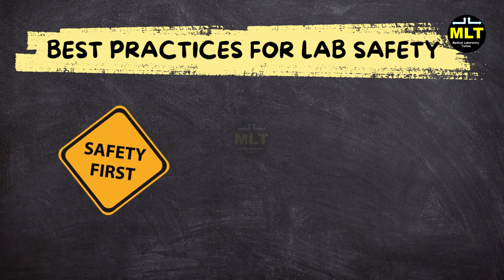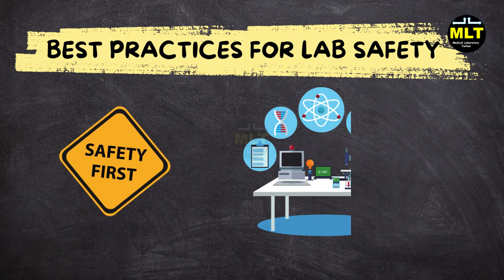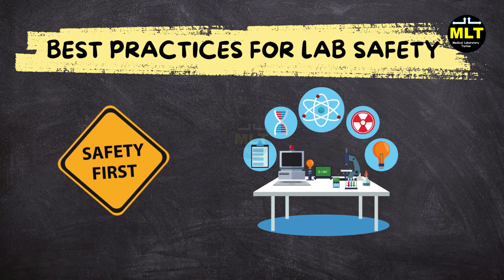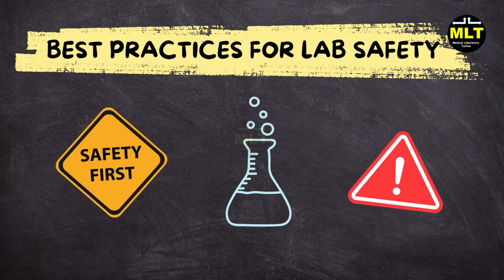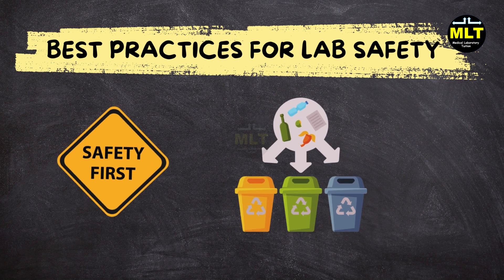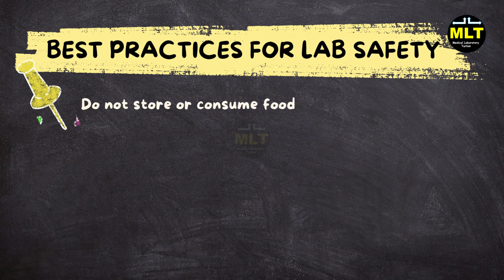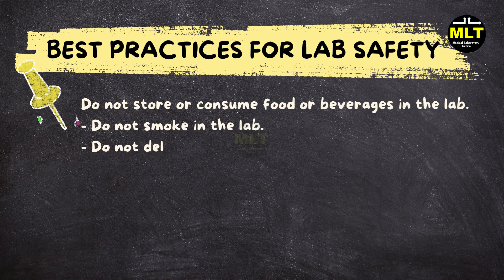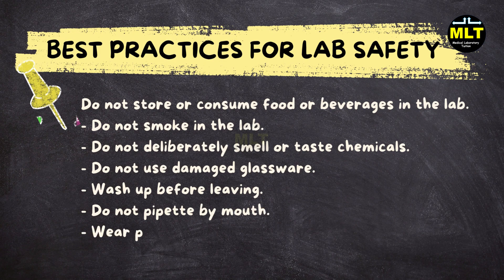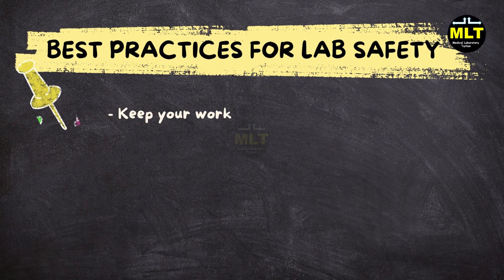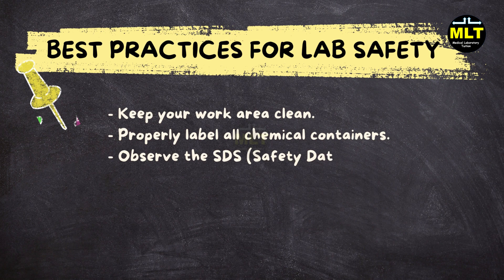Section 7: Best Practices for Lab Safety. Staying safe goes beyond just knowing what to do in an emergency — it's also about your daily activities in the lab. Regularly check equipment and ensure chemicals are labeled and stored properly. A clean workspace is key to avoiding accidents and contamination. For instance, if you leave chemicals uncapped, they could evaporate and create hazardous fumes. Properly dispose of chemical, biological, and sharp waste materials to maintain a safe environment. Important reminders: Do not store or consume food or beverages in the lab. Do not smoke in the lab. Do not deliberately smell or taste chemicals. Do not use damaged glassware. Wash up before leaving. Do not pipette by mouth. Wear proper PPE. Keep your work area clean. Properly label all chemical containers. Observe the SDS safety data sheet. Post appropriate warning signs.